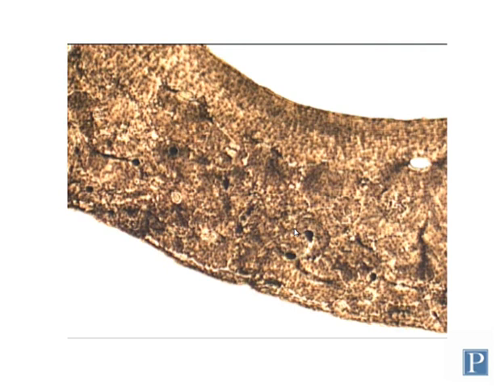So those structures can be easily seen in decalcified bone preparation. This section here is also of compact bone, but you can see it has quite a different appearance because it was prepared in a very different way. This method of preparing bone that you need to know is called the ground bone method, and essentially it involves grinding a section of bone until it becomes very thin, enough to where light can actually pass through it. And then it's basically mounted on the slide, and you can look through it with the scope.